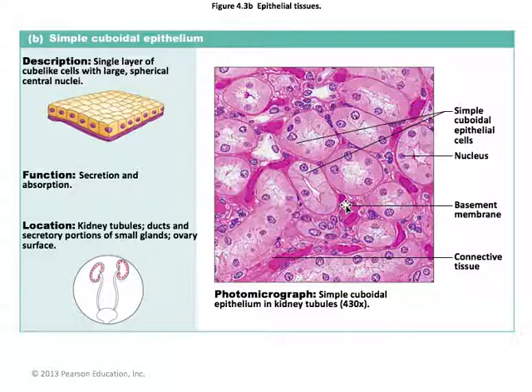What else do I want to say about this? So look out for those nuclei. All the little purple guys in there are the nuclei, and they are representing different cells. This isn't the greatest picture of simple cuboidal epithelium, but you can see a couple bricks in there. You can see that defined, like right here. You can see how that cellularity, those specialized contacts, how they're attached to each other very, very much.